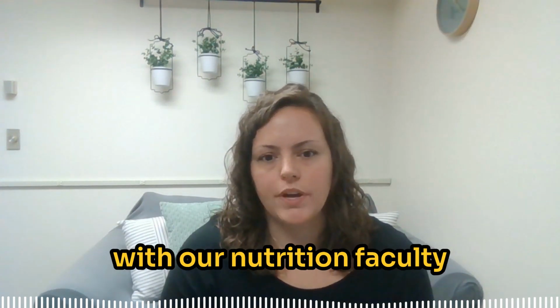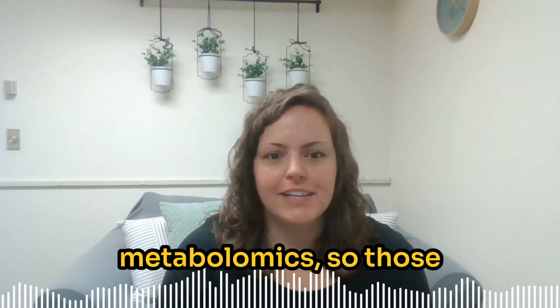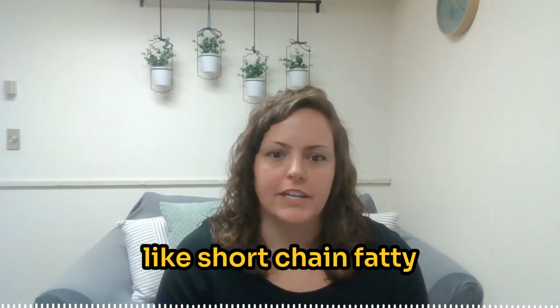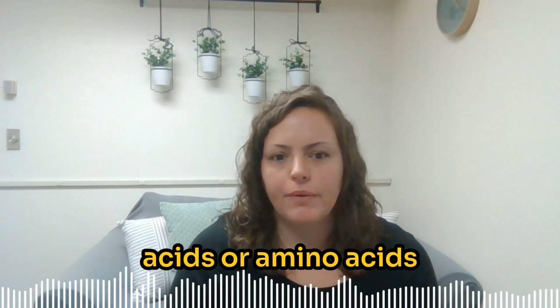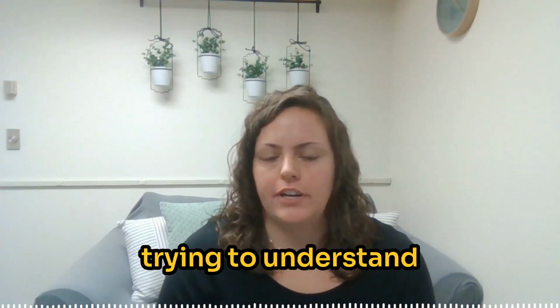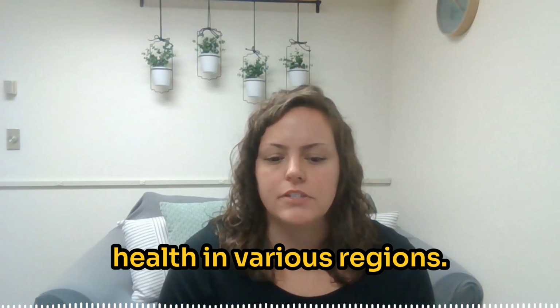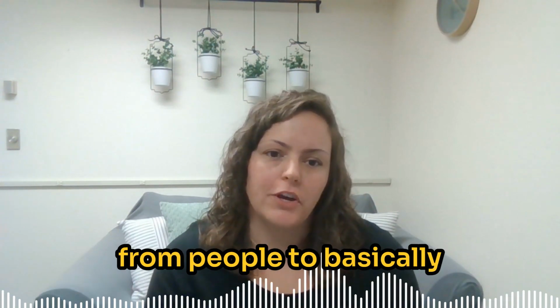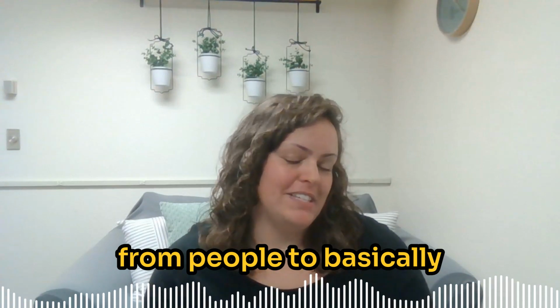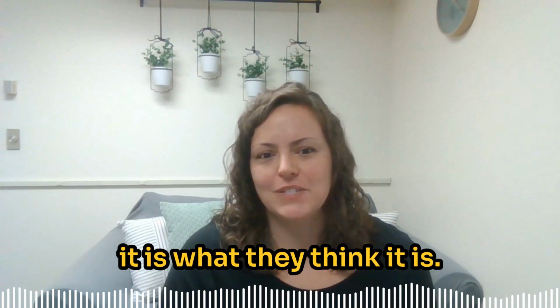And then we're working with our nutrition faculty like Matt to look at metabolomics. So those really small molecules like short chain fatty acids or amino acids that are found in urine or blood or feces, and trying to understand how that might impact health in various regions. We get a lot of requests from people to basically look at their products for purity or verify that it is what they think it is.